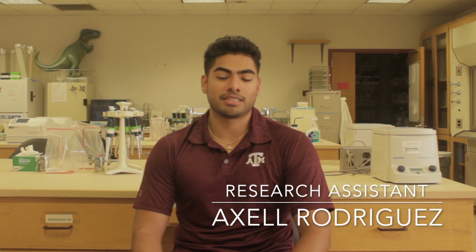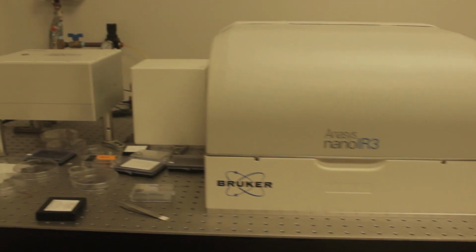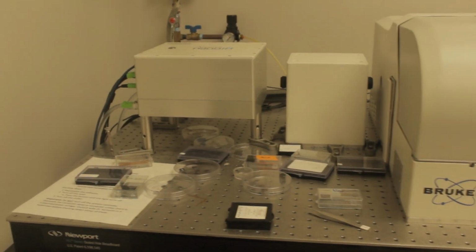I'm Axel Rodriguez. My focus is on studying the proteins we express through nano-IR using atomic force microscopy. With this instrument, we can observe the protein morphology, mainly their secondary structure, to understand their development in amyloid protein aggregation. Here we have the instrument, the nano-IR3 from Bruker Nano, which is a combination of AFM and IR spectroscopy.